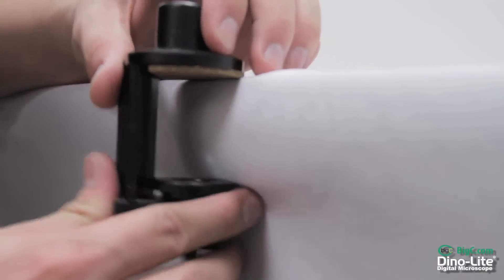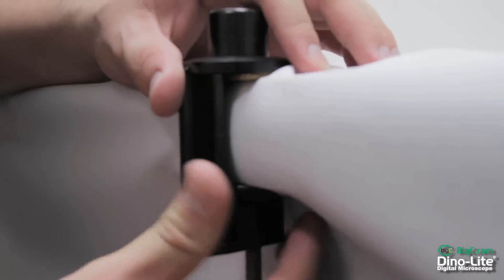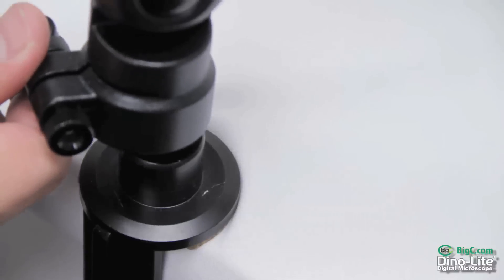In addition to the tabletop mount, the MS-52B also comes with a sturdy clamping side table mount as well.